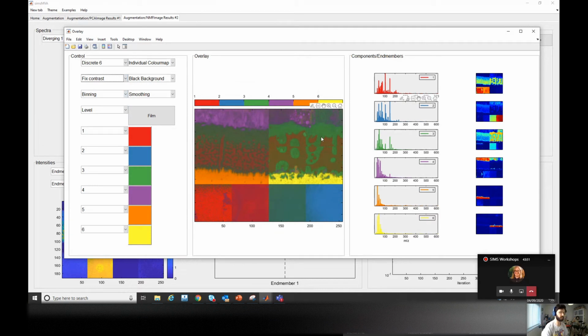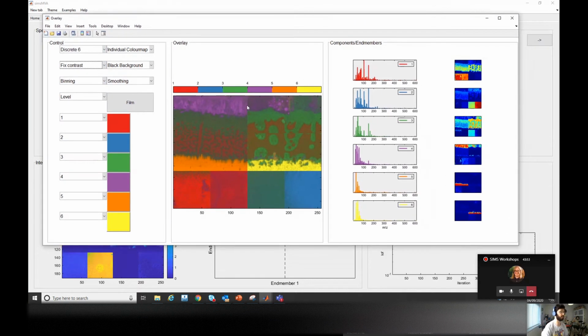So you start to see the distribution within your complex cross section and also in your reference samples. You can see here it's not as perfect as I showed in the slides, and the reason is we didn't use enough NMF factors basically. So it's a matter of exploring, but it helps a lot having the standards here, because now we know where they are.